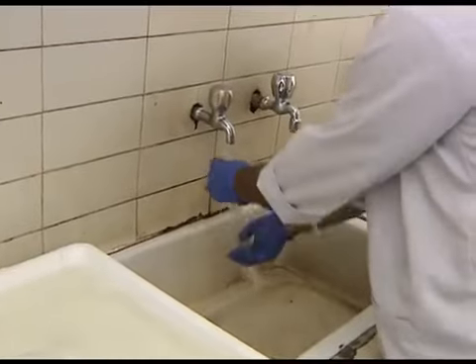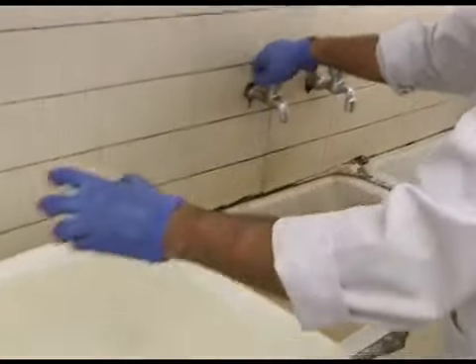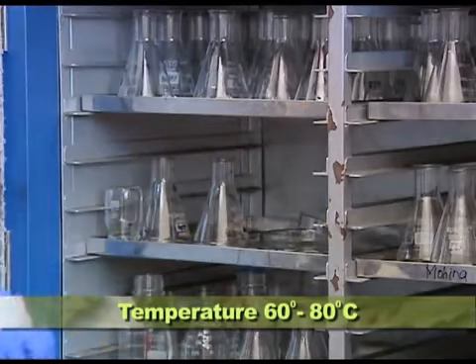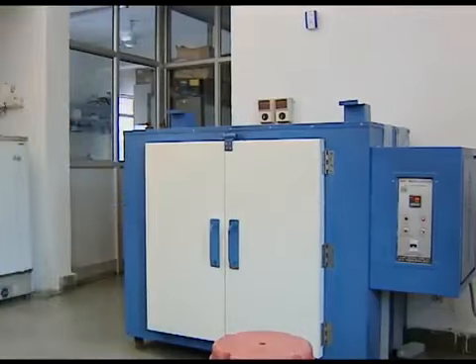Finally, the glass and plasticwares are washed under running tap water, kept in clean trays and put in an oven maintained at 60 to 80 degrees Celsius for drying. The dried glasswares are now ready for use.